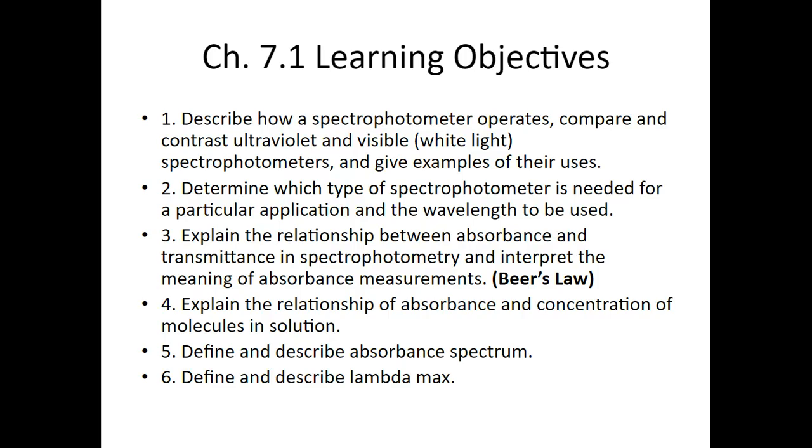We don't usually talk about that in biotech, so this will be our way to go over that, and then it may relate to chemistry. Explain the relationship of absorbance and concentration of molecules in a solution, and define and describe absorbance spectrum, and of course define and describe lambda max.